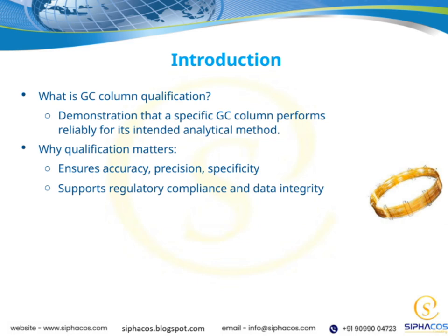In a regulated environment, having validated performance isn't just good practice, it's essential. So, as we move through this presentation, keep in mind that qualification isn't just a technical requirement. It's a vital step to ensure our analytical methods are reliable, accurate, and compliant.